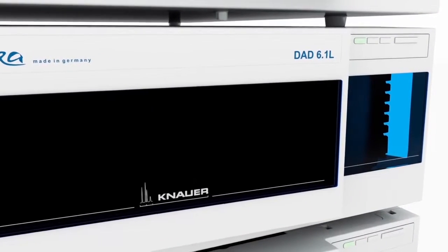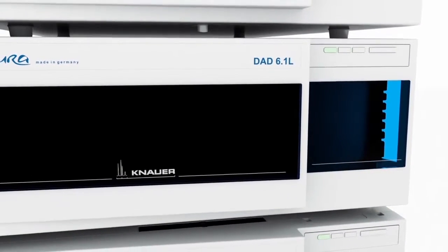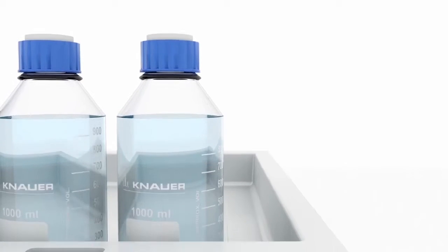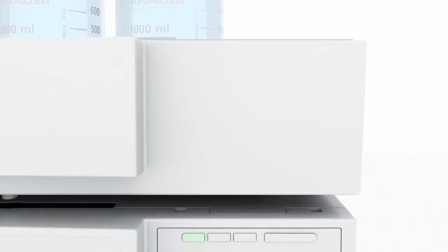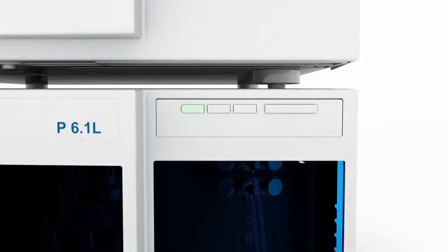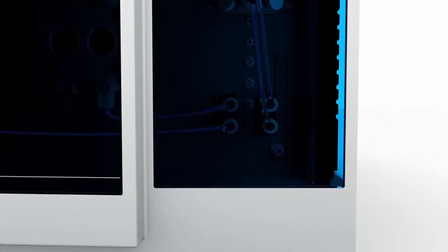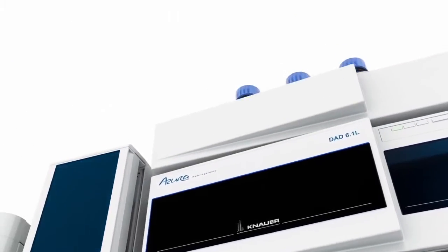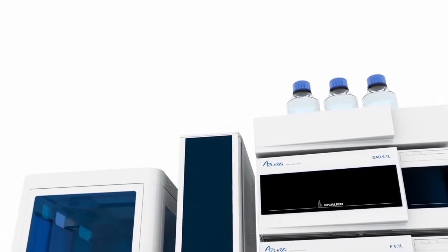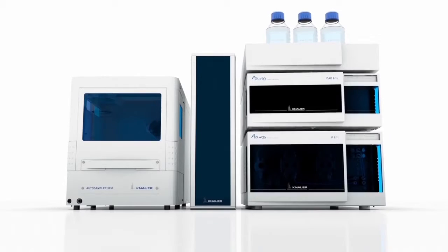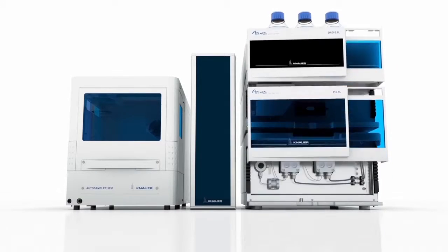Azura HPLC systems are modular and can be set up according to your needs. Choose between different instruments to design your unique system that can easily grow with your requirements and applications. Pumps can be equipped with different kinds of pump heads, detectors can be upgraded. Even single modules within an instrument can be exchanged by different ones. The customer is able to react to every eventuality.